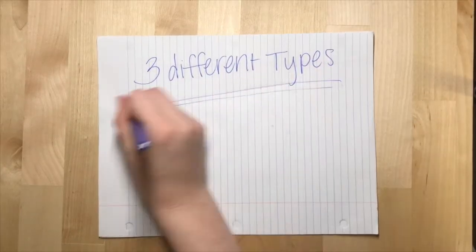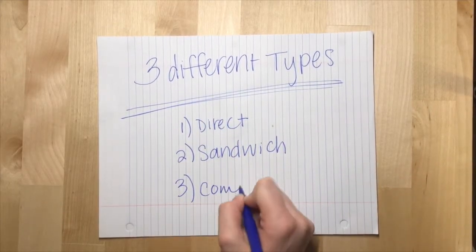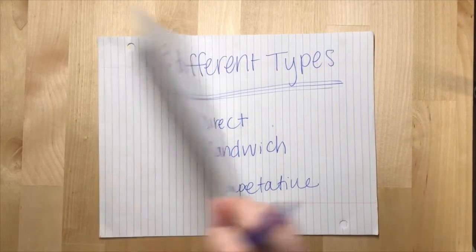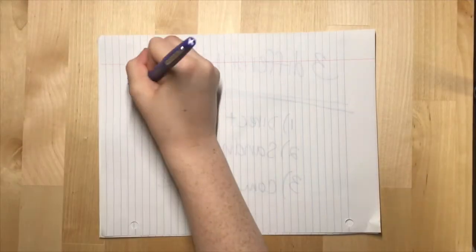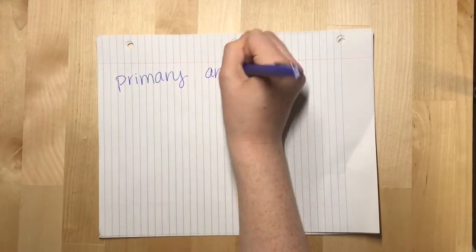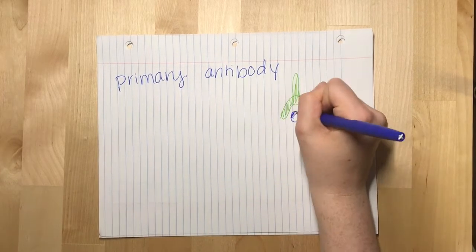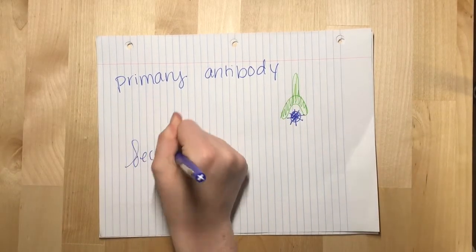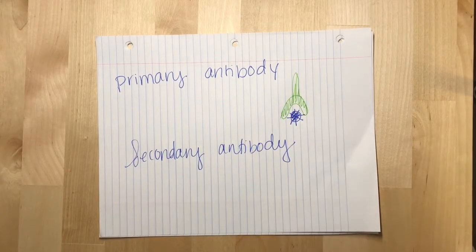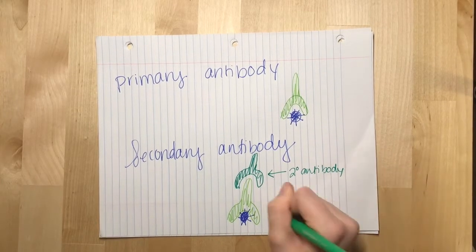There are three different types of ELISAs: direct, sandwich, and competitive. Before we can get into the specifics of these, we need to review a couple vocab words first. The first word is primary antibody, which is simply an antibody that binds directly to an antigen or protein. The next word is secondary antibody. These bind to other primary antibodies, which are then bound directly to antigens or proteins.